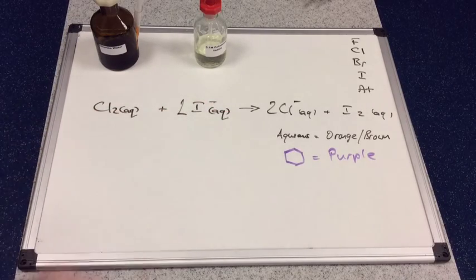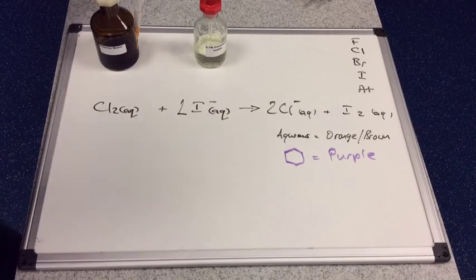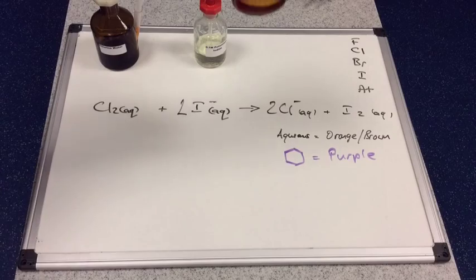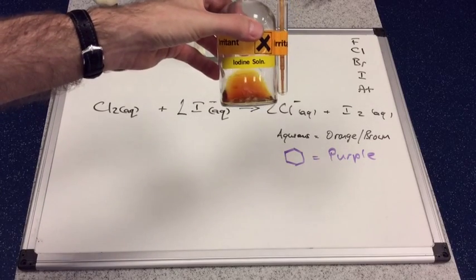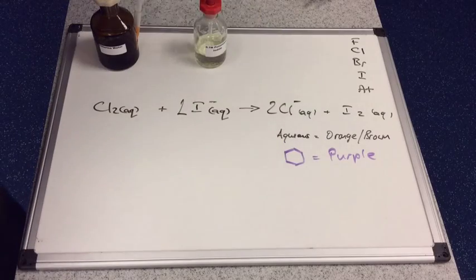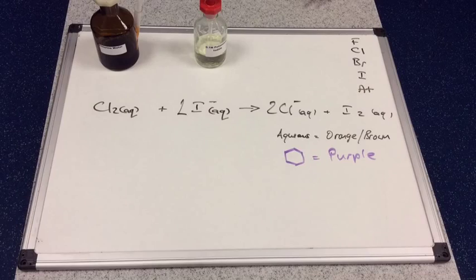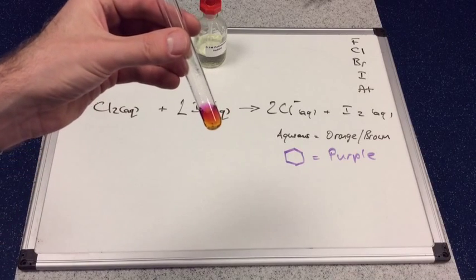So in aqueous conditions, iodine's a kind of orangey-brown color. If I just show you this bottle of iodine solution, you can see there's the color of iodine in solution. But in cyclohexane, it dissolves completely in cyclohexane and so we've got that nice purple color there.